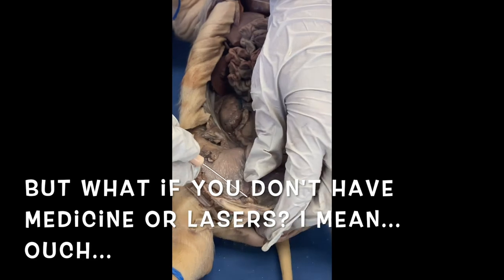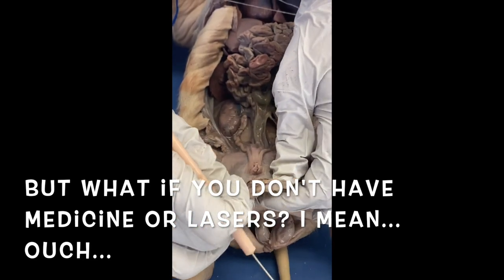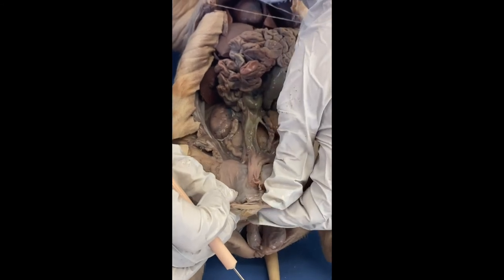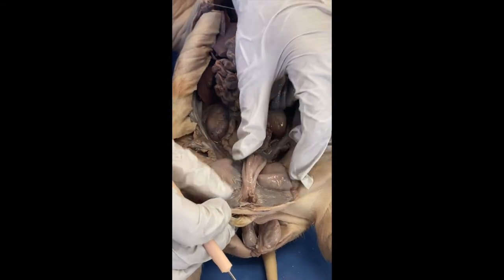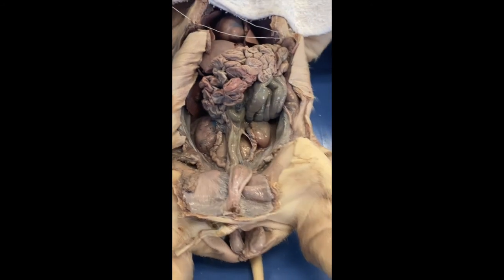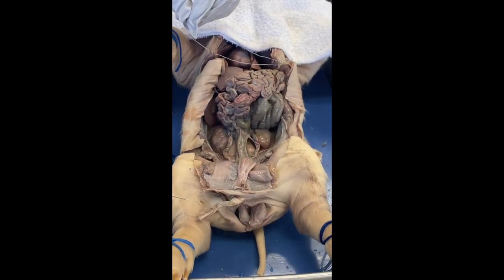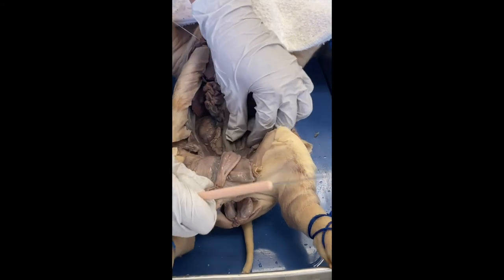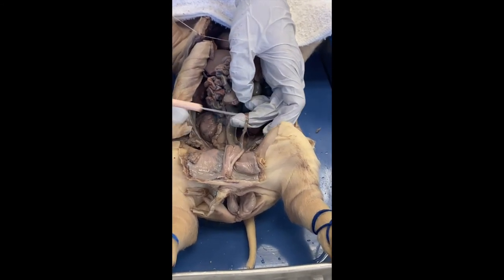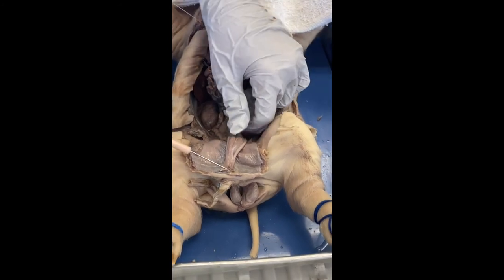here and out through. And the penis on the pig, I'm going to tell you, sometimes it's not as developed on the fetal pig because they're obviously not grown. They haven't been born yet. All right, perfect. So when they talk about passing a kidney stone, it hurts because it's going from the kidney all the way through this small tube. Absolutely. And then through here.